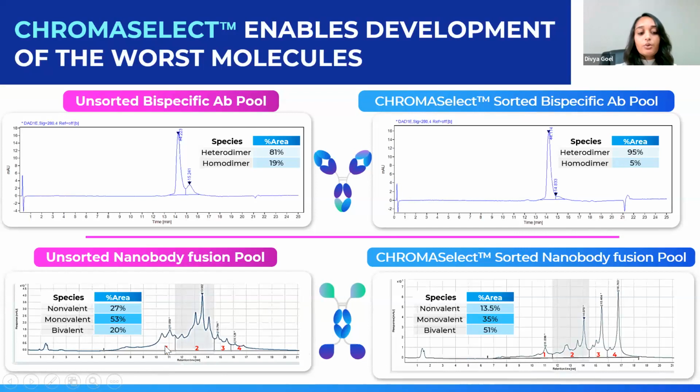Region 1 listed here corresponds with the non-valent product, which accounts for about 27% of the product. The middle section 2 is the monovalent species, which accounts for 53%. And regions 3 and 4 are the intact bivalent species. So before sorting, the nanobody fusion only had 20% intact bivalent product. After doing the ChromaSelect cell sorting, we were able to increase the bivalent population to 51%. This is just at the pool stage. And again, we can then subclone and identify clones with even higher levels of the bivalent product.